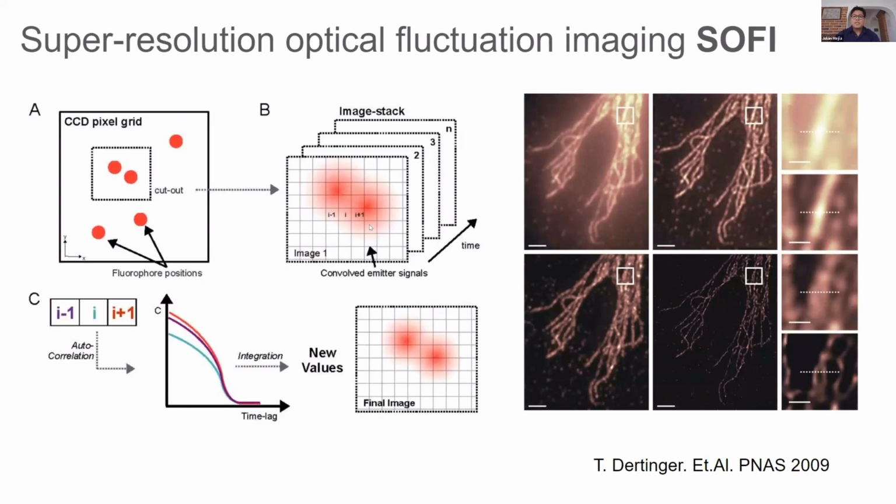Something that I would like to comment on here is that the team that developed SOFI has developed pySOFI. pySOFI is a really powerful tool. It's not only for reaching super resolution, it is also really good at denoising, and they apply different kinds of shrinking kernel deconvolution that are really useful for denoising or for increasing contrast as well. So if you're curious about that, I highly recommend you check pySOFI.